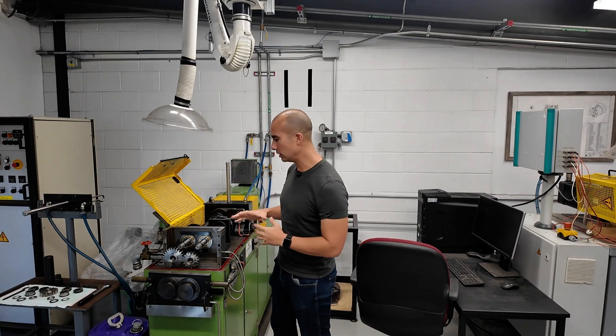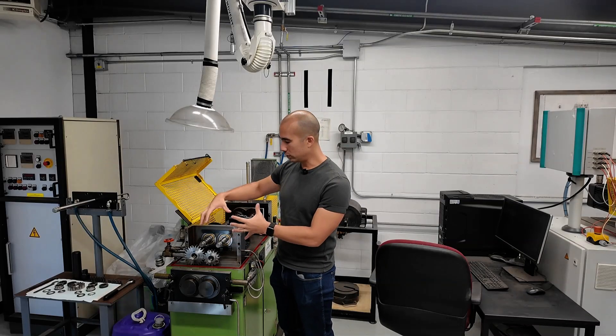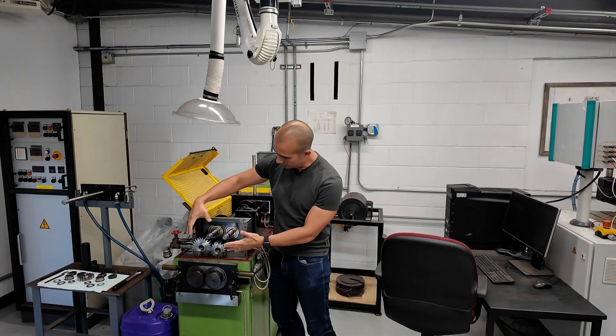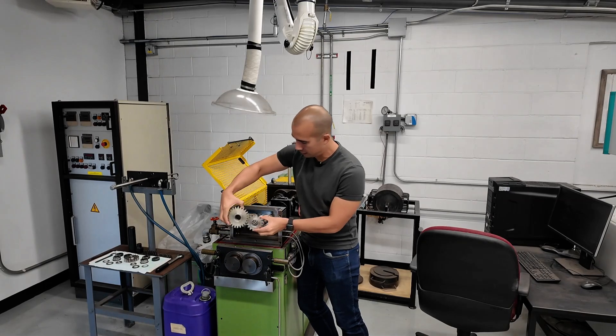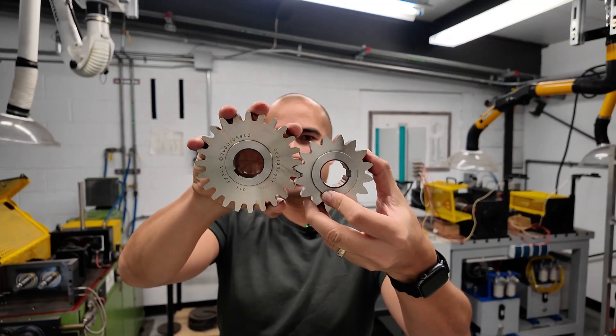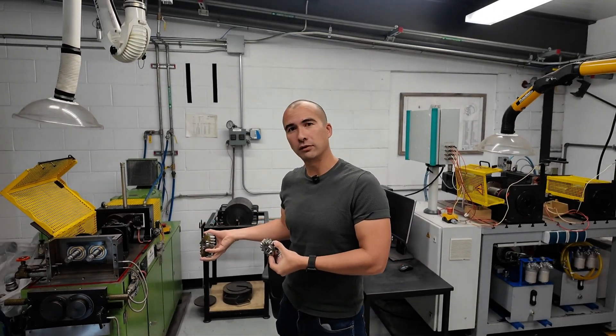The test caps out at stage 14 — we don't actually have an official FZG stage 15. There were attempts to make an FZG rig that could go up to 15, but you run into safety risks because once you put a huge amount of load through the gears, you run the risk of actually snapping the teeth off, which becomes ballistic, and you need a effectively bulletproof facility. So this is the actual gear teeth themselves — a standardized profile. This is not a typical set of gear teeth; the way that they fit together is a very specific fit, designed because you want to stress the gears as much as possible. You're actively trying to fail the gears in a short space of time.